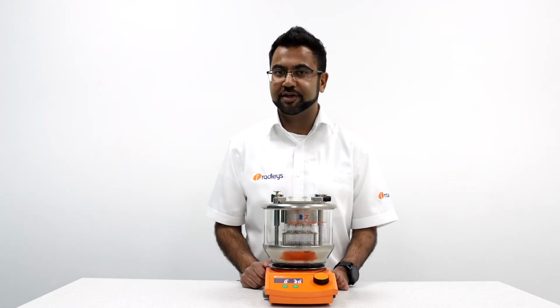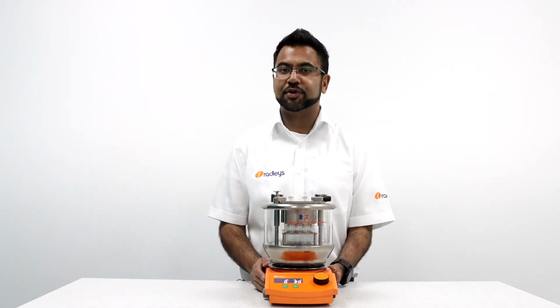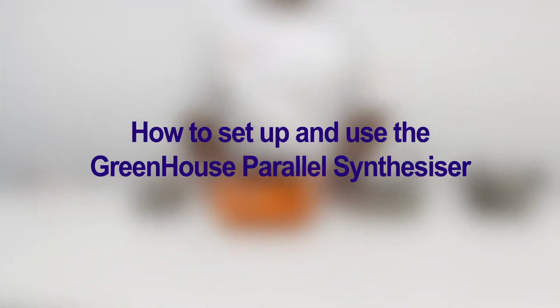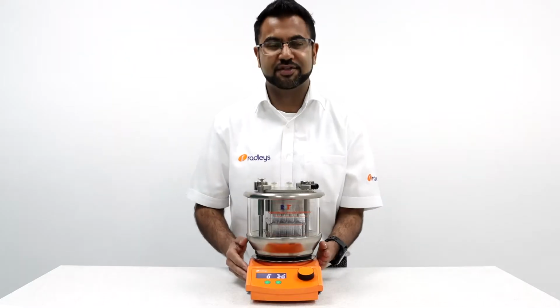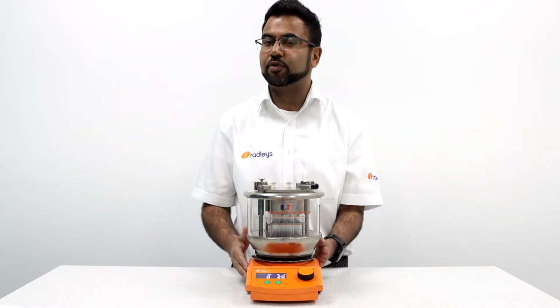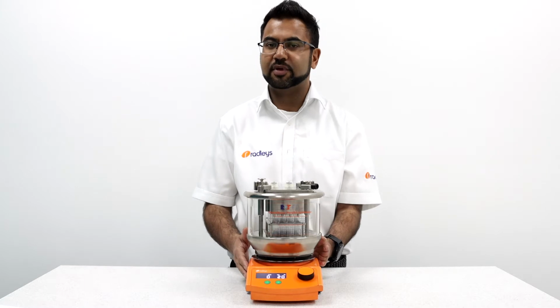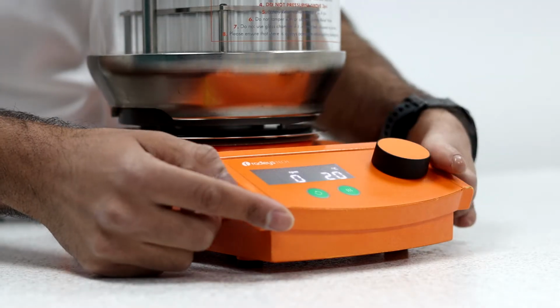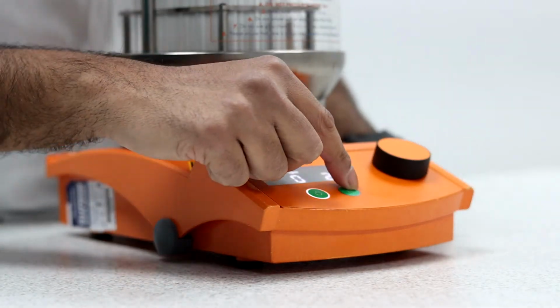Hi, in this short video today I'm going to show you how to set up the GreenHouse Plus parallel synthesizer. The GreenHouse synthesizer allows you to perform up to 24 reactions in parallel, from 0.5 milliliters up to 7 milliliters, all on a single hot plate. Your stirring hot plate provides your heating and your magnetic stirring.